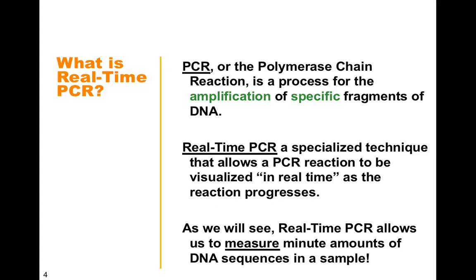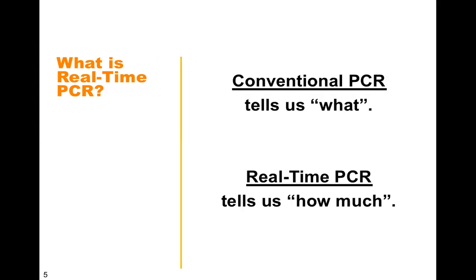You can statistically and accurately say how much difference there is compared to the other one. Another beauty of this technique is that even if a single copy or half a copy is there, you can amplify it and detect it because the machine is very, very sensitive. We have just covered the difference between PCR and real-time PCR.